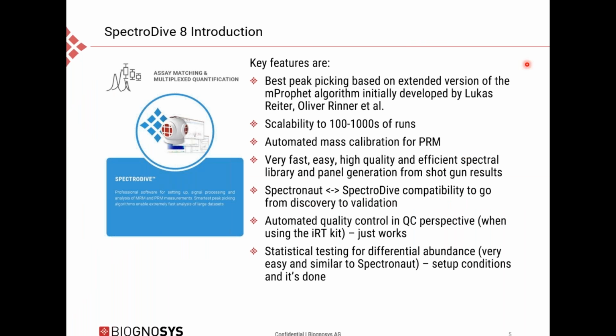The focus of today's webinar will be on the back-end part of our targeted proteomics portfolio, our proprietary software SpectroDive. About a month ago, we released SpectroDive 8, our latest release. SpectroDive is built on the iRT concept and uses the iRT peptides for targeted and scheduled MRM and PRM measurements.